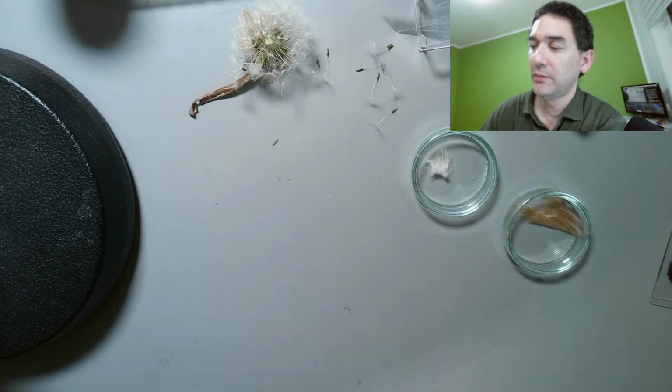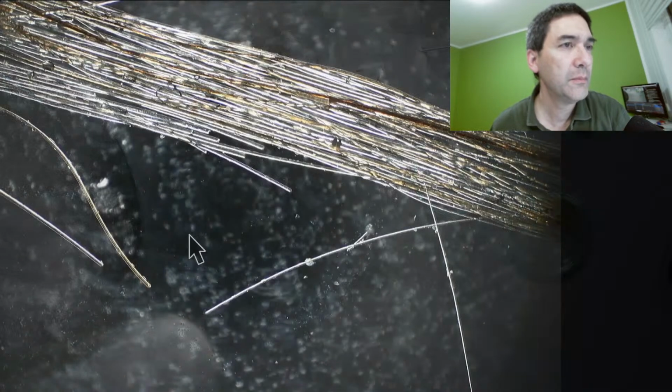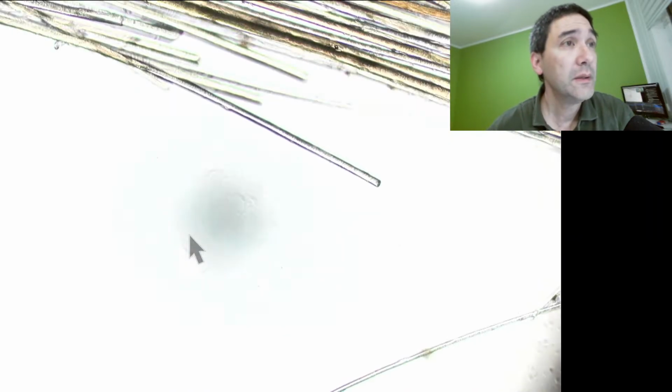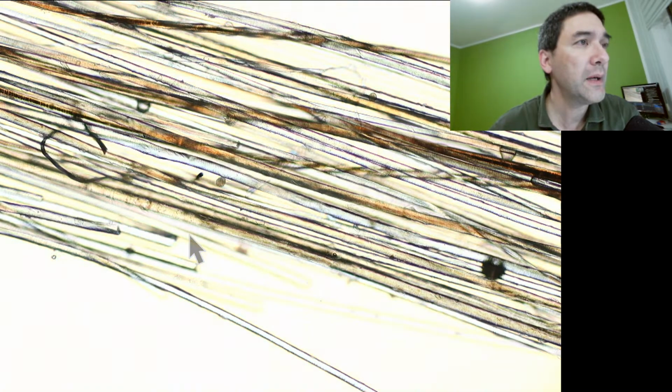And this is the dog fur. And here too, if we go up with the magnification, we're going to see that it is highly textured.